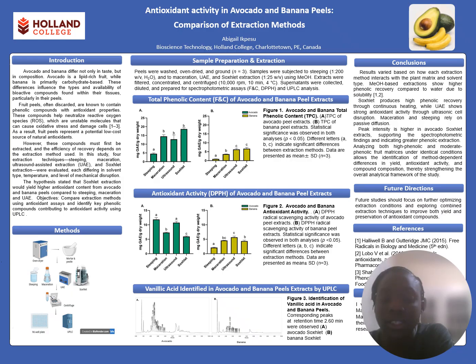And for the chromatographic image here, we can see that we're able to identify and quantify the phenolic compound which we tested for, vanillic acid, and the avocado had a very high peak intensity here with a high concentration from the avocado Soxhlet extract.